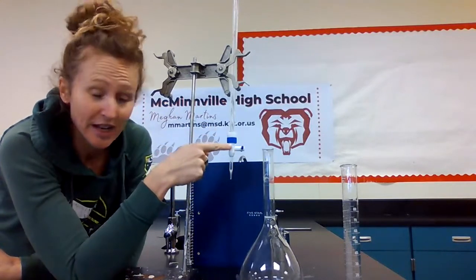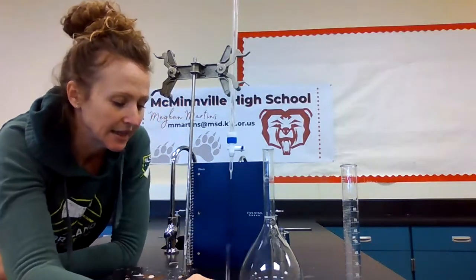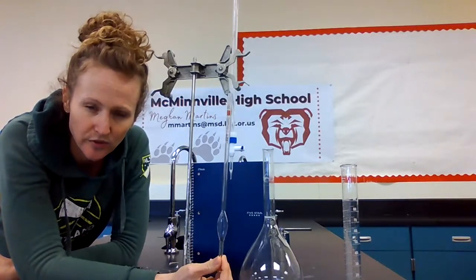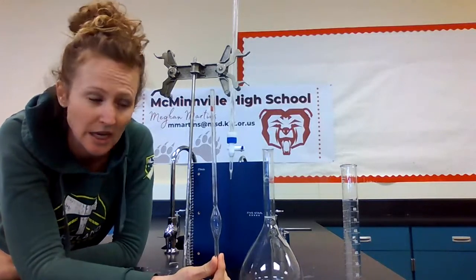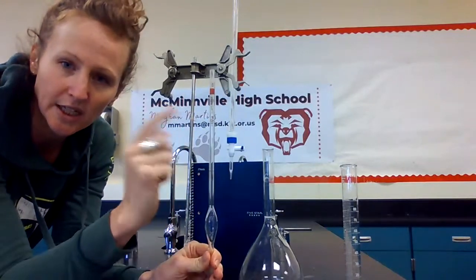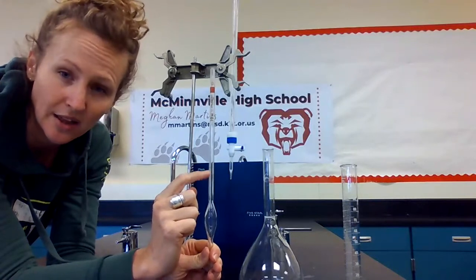Okay, so the burette is also good for measuring smaller volumes, and it's really good for adding small amounts of liquid very consistently. Okay, this is called a pipette. A pipette is also used for sucking up and dispensing very small, specific amounts of volume. This one is marked to measure 10 milliliters. Some of them are graduated, some are not. This one is not graduated, so you can only measure out 10 milliliter aliquots. You can't measure out anything else.